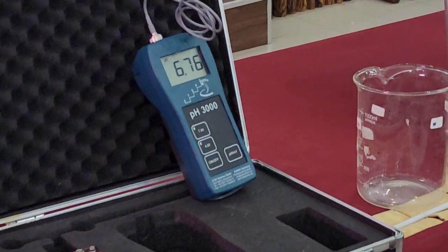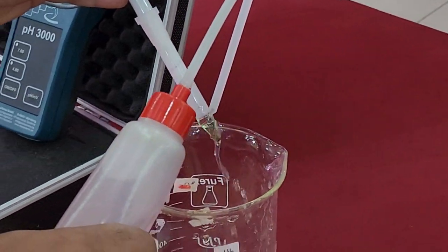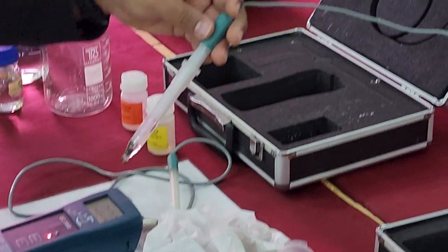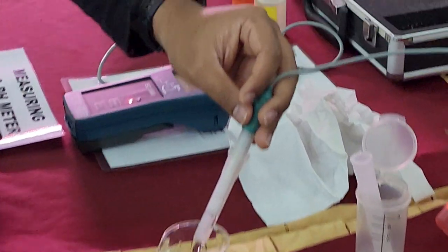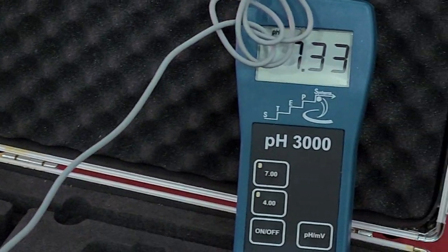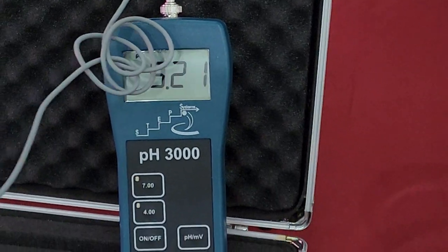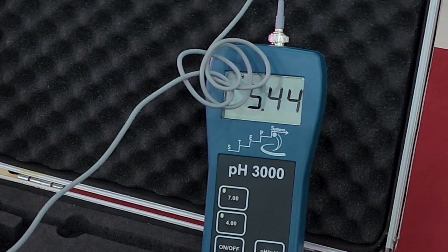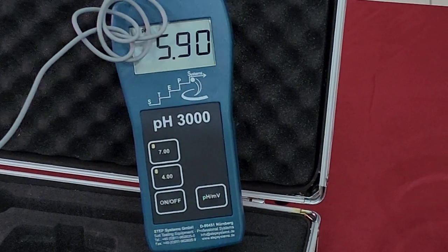You want to see the pH for this? I need water for this. Always clean your probe, okay? Okay, let's play another guess game. What's the pH of distilled water? Want to guess? 7. Let's see. Is it really 7? Oh, it's not 7. It's even more acidic. About 5.7. Let's see the pond water.